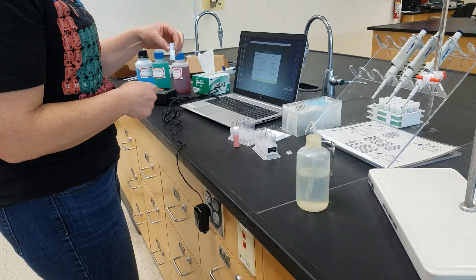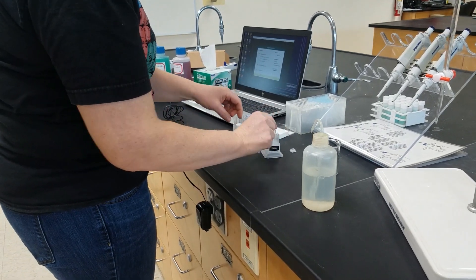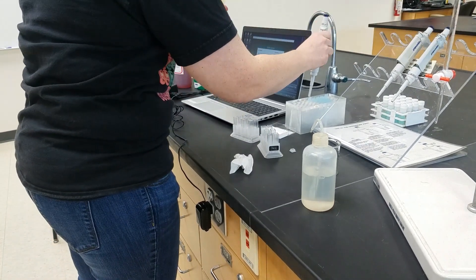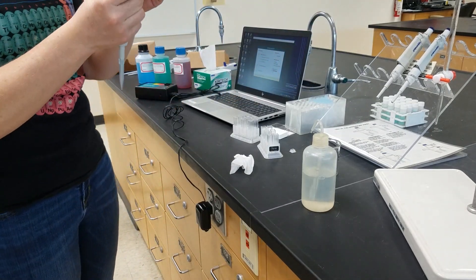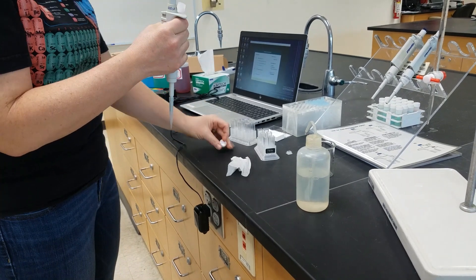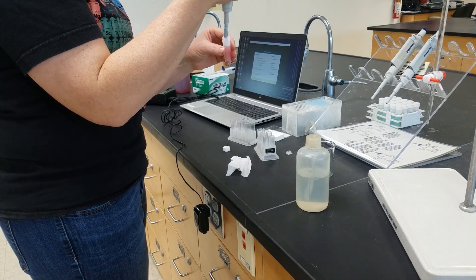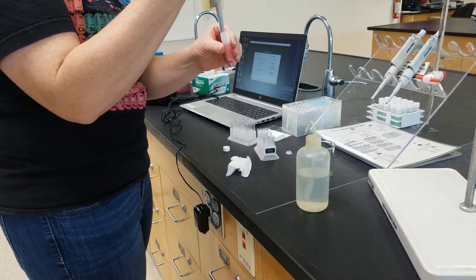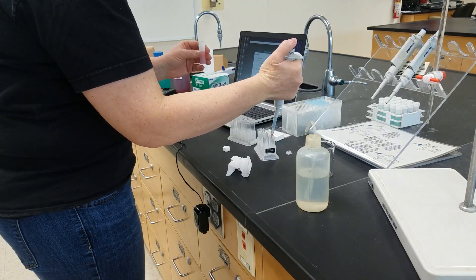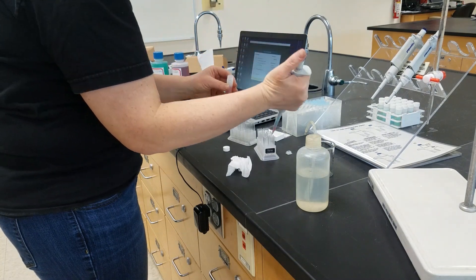We're going to prepare our unknown cuvette by taking 1.5 milliliters of our unknown. We're going to use an Eppendorf pipette that is set for 500 microliters, 0.5 milliliters. Push down on the top — that sucks up 500 microliters. Because we need 1.5 milliliters, we're going to have to do this 3 times.